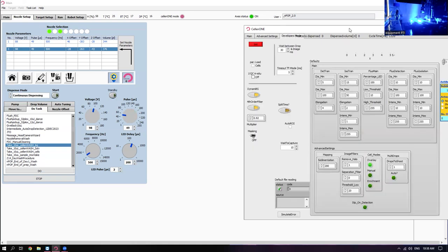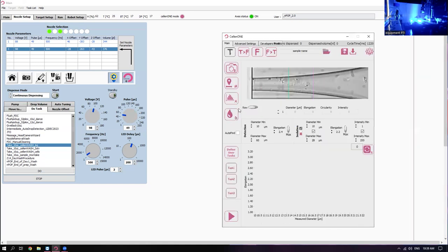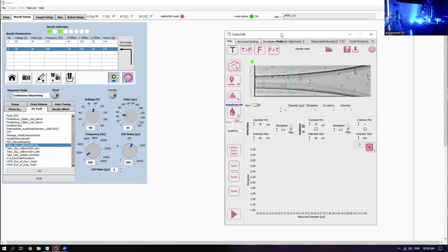Not currently. No, it is not. So I'm going to set our region here. And we'll take, yeah, absolutely. So I'm just turning on some drops here. So we see our cells flowing through.